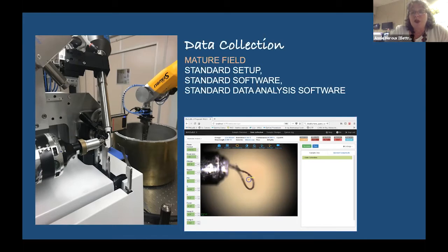This is also software that you can use remotely, in the web browser. You just type the IP address that we give you, and you can collect remotely. This is standard now at most of the facilities, and that has been a standard for almost 10 years now. So this is not new, but with the pandemic, that's been a reality that we need to do.